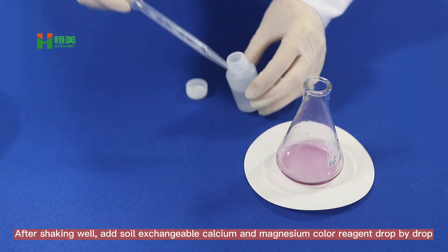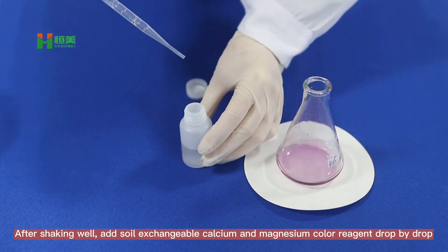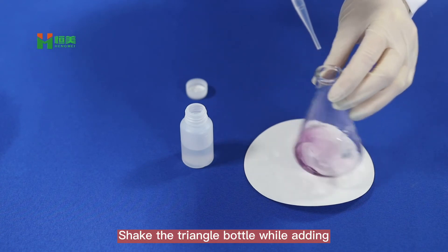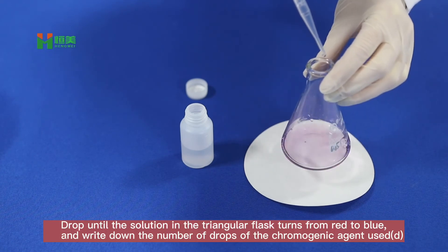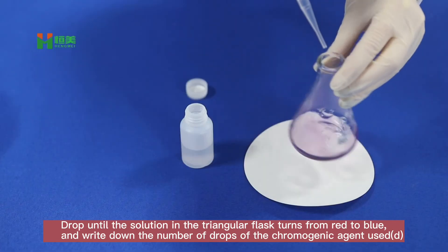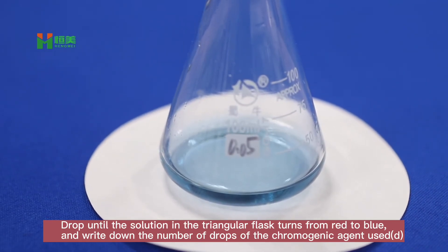After shaking well, add soil exchangeable calcium and magnesium coloring agent drop by drop. Shake the triangular flask while adding drops until the solution turns from red to blue, then write down the number of drops of the chromogenic agent used.